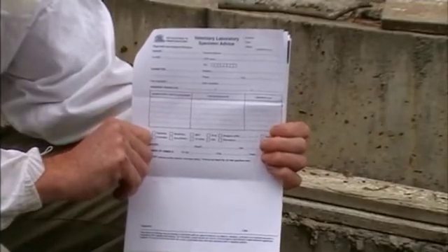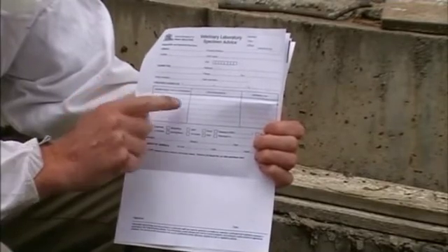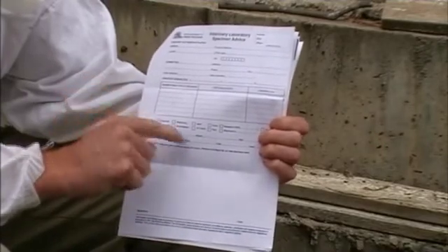You need to fill out a lab report — put your contact details, your name and address, your phone number preferably, the location of the beehives, how many beehives are at risk, and what you think it is. Do you think it's European, American? The more information you put on that report to the lab the better.